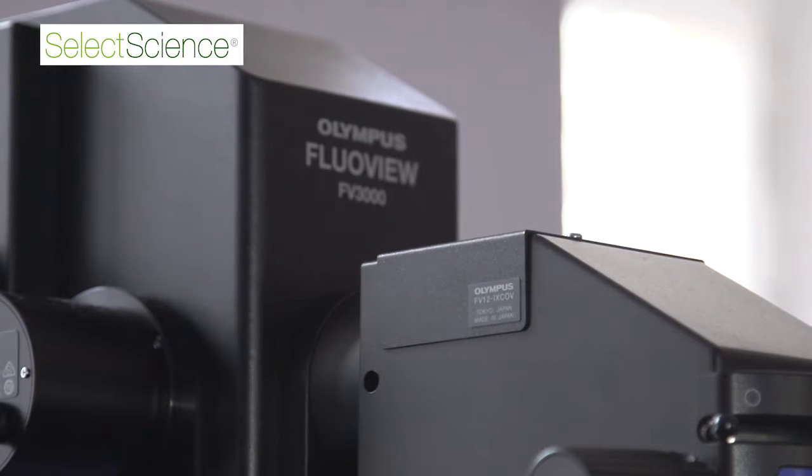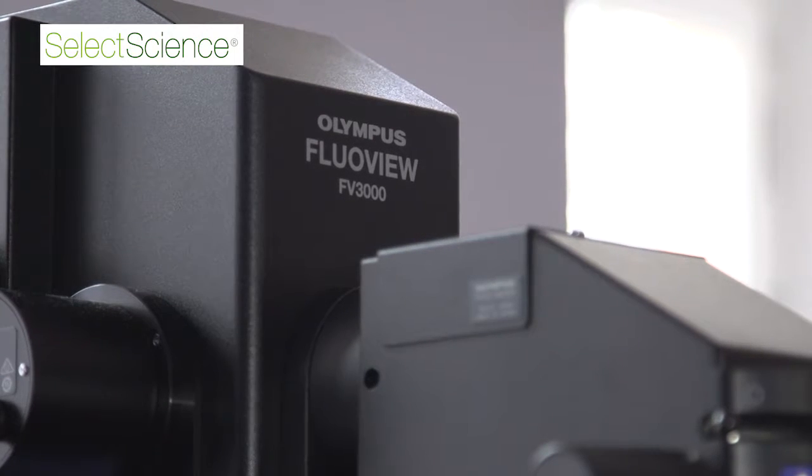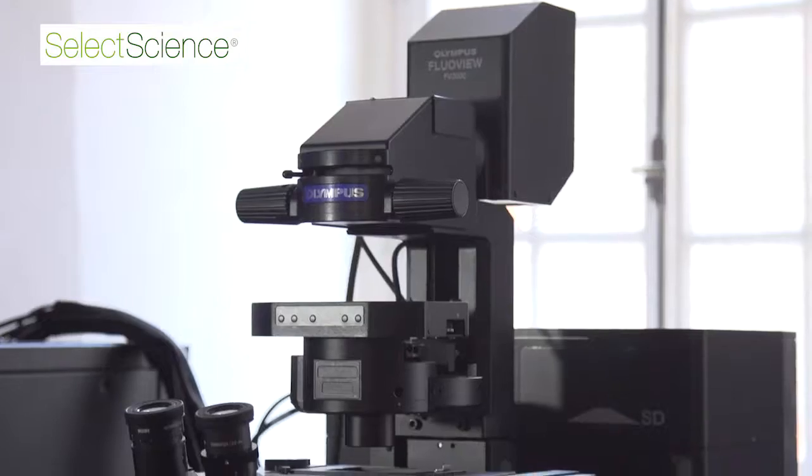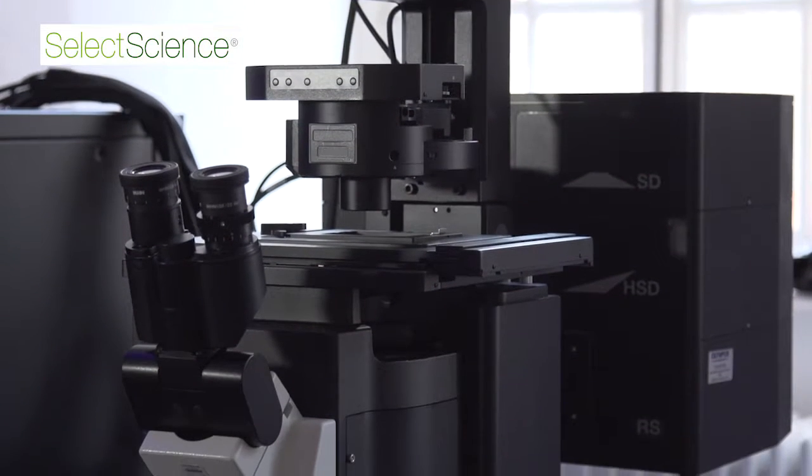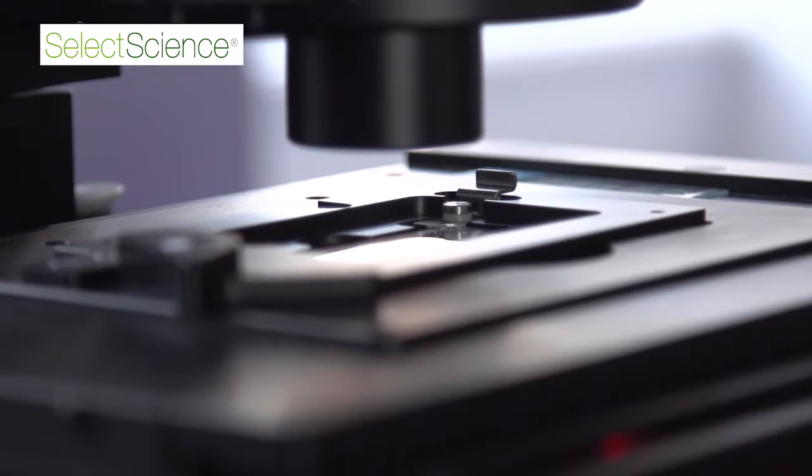The spinning disc is very rapid, but the disadvantage is it's only a single wavelength for our particular system. So if we want to do multiple wavelengths, we move to the line scan confocals, and we quite often use fluorescent indicators for cell structures between cells and within cells, as well as doing calcium imaging. So the ability to have multiple laser lines to image at a fast speed is what we always desire.